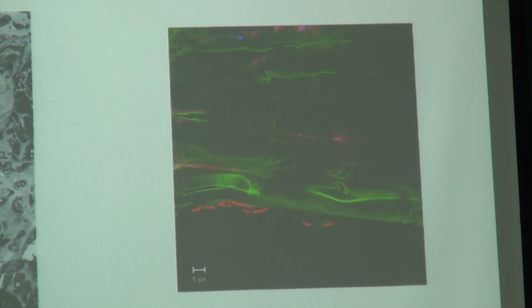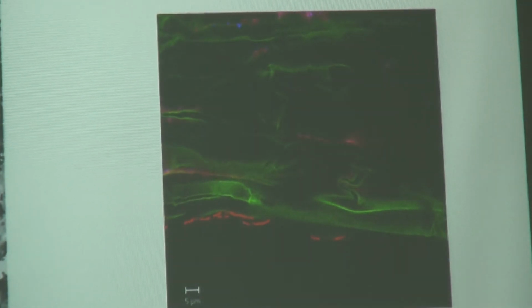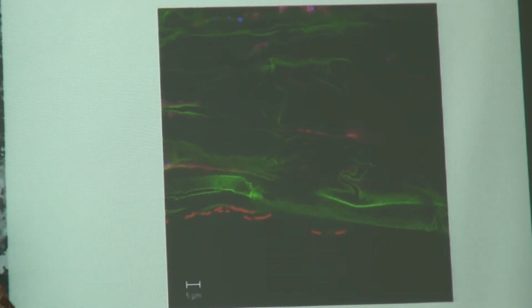And similarly, this is an image which is kind of similar to the one you've seen with the root. The bacteria on the root proper will be totally unevenly distributed. You will find bacteria at certain locations on the root. For instance, you see on the root tip, near the root hair, where the exudation, where the secondary root branch comes from the root. You will find a lot of bacteria on the epidermis, but much less inside or in between the cells. So also on the root, the bacteria are associated with the plant at very specific locations.